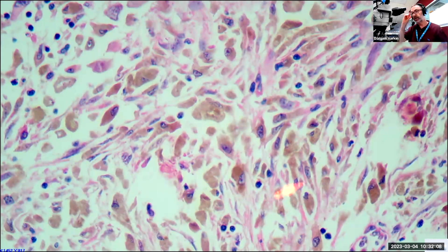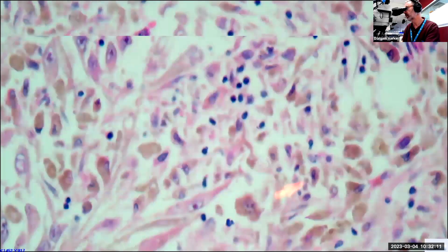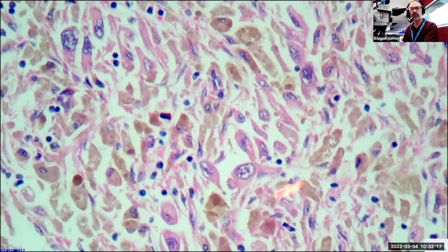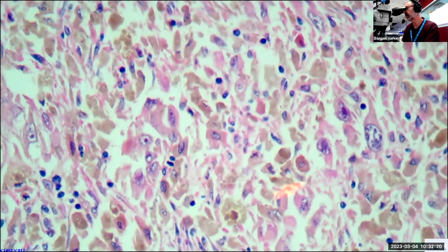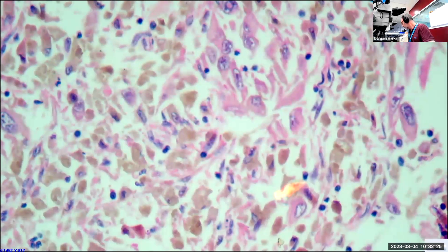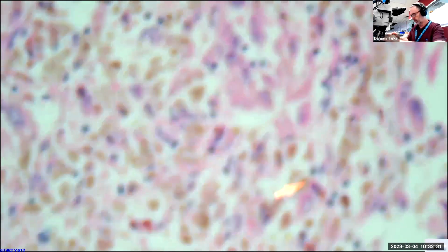In a diagnostic sense like this one, perhaps if you were looking to have a quick assessment as to whether this is melanin or not, this has certainly reduced the level of brown staining, but it looks like for whatever reason that it hasn't done that completely. So I'll just show you another one here. This is actually the same. It does say melanin bleach. My apologies for not checking this beforehand. Okay, well, this one has not actually been bleached either, so it's been incorrect. Okay, so this is not going to be able to show you that any better, unfortunately.